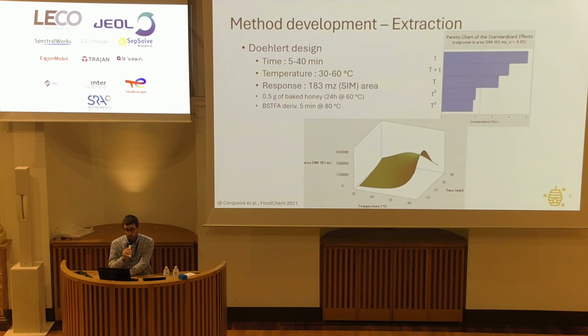Here, what we observed is that the time, the temperature, but also the interaction were significant. So we reached an optimum at 17 minutes of extraction at 60 degrees.